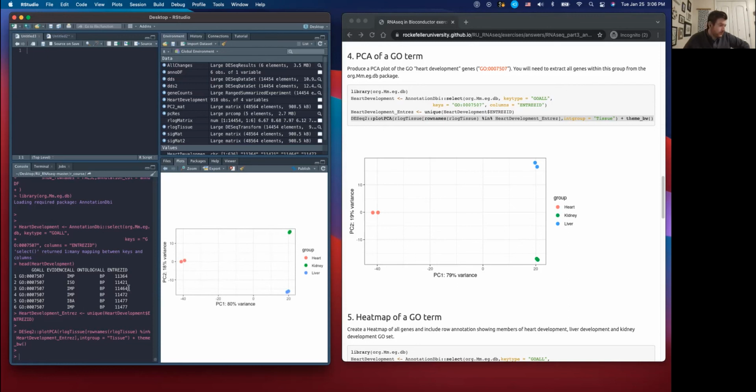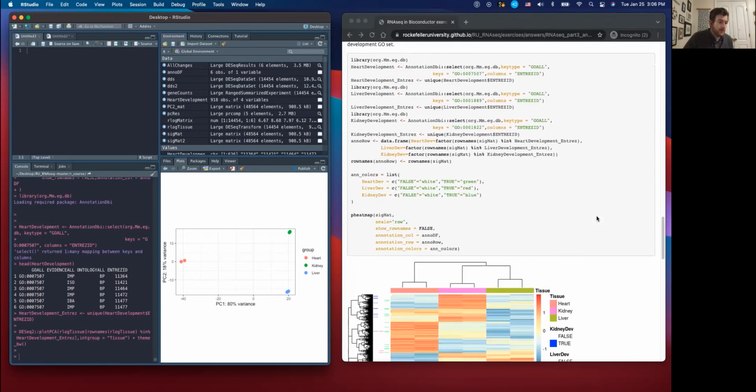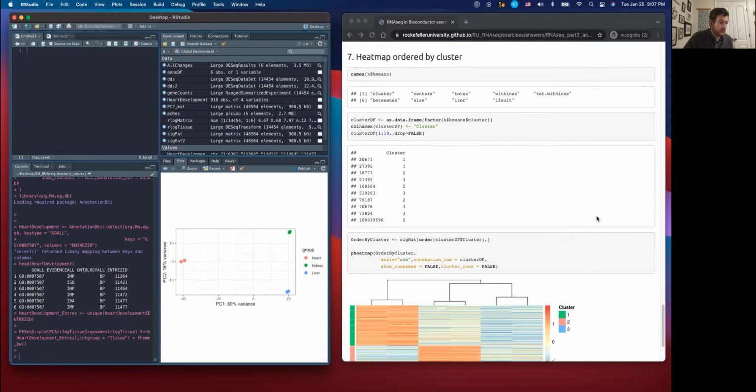So we're able to start to drill down and do some interesting things with specific groups if we want. You can see how using the skills we've learned, we can actually start to really break things down and ask very specific questions. Yeah, and so then, we have a little bit more to go.